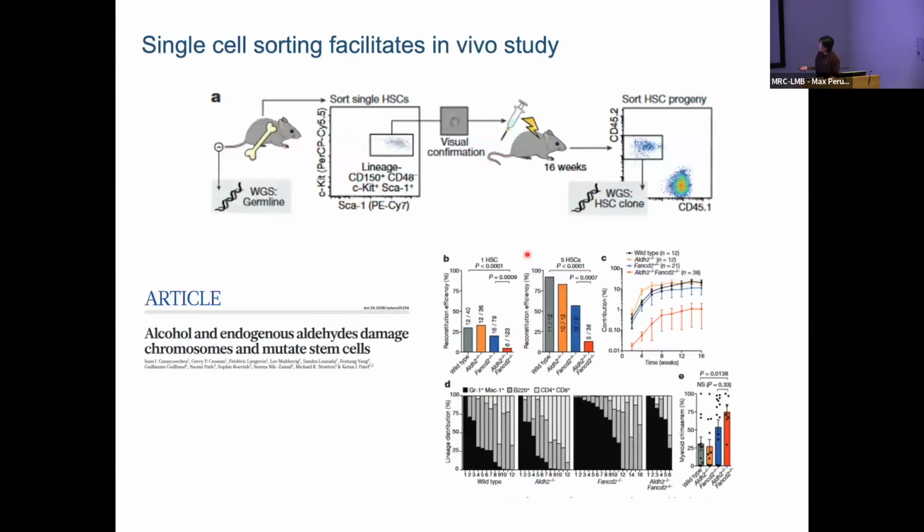So these HSC cells can be isolated by a cell sorter. Years ago, Huang and Jerry did this experiment. Isolating HSC cells was quite difficult because the frequency in the whole sample is sometimes 1 in a million.